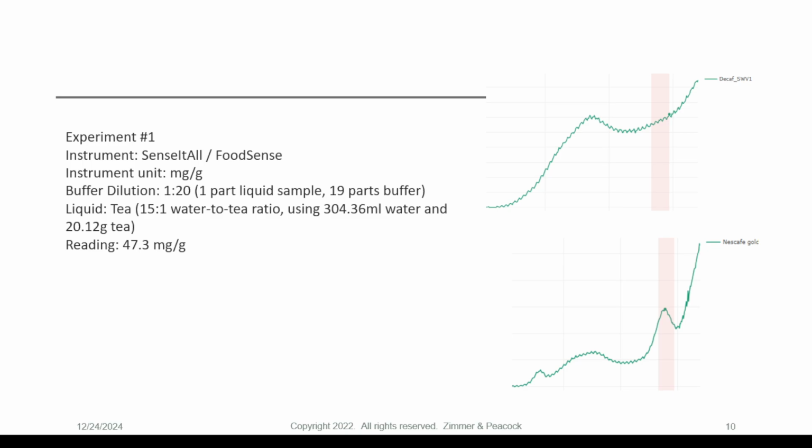If it's all flat like this, it may be we can't dilute that too much. If it's nice and peaked like this, then we're onto it, and we can see the caffeine. What I suspect is that this is quite diluted, and there's some sort of background molecule that has raised what we call the baseline, but is not caffeine.